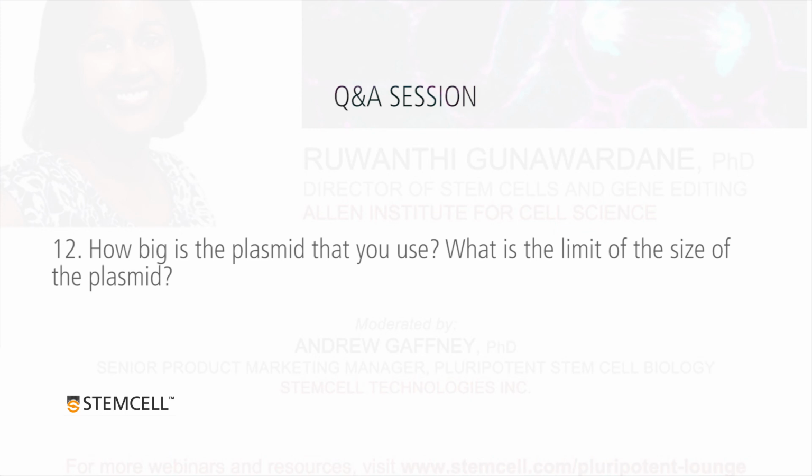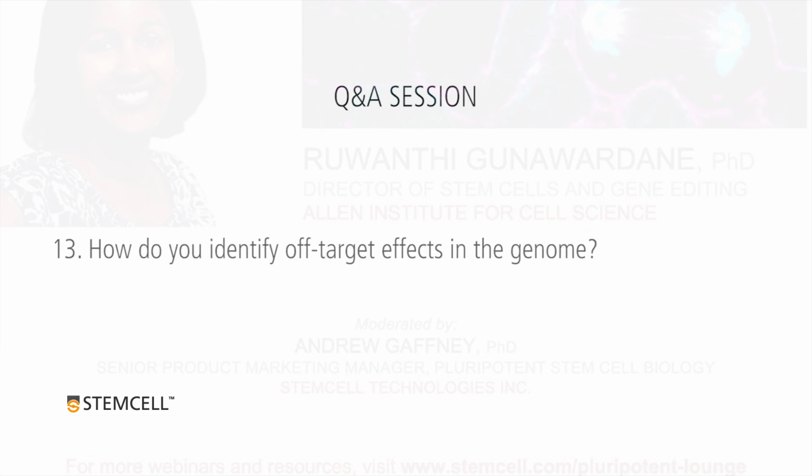We have used it to insert up to 3 kb for another pilot project. So I can't say for sure, but I'm assuming that then it was around 8 kb. Okay. And how do you identify off-target effects in the genome?